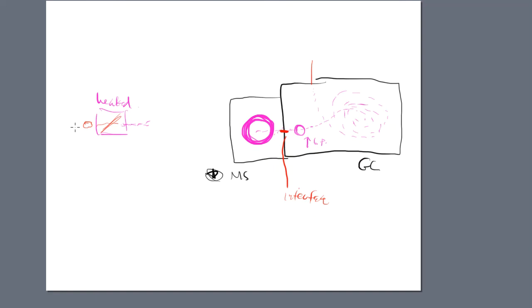All right. The other thing was the M to Z ratio, and the M to Z ratio was at the bottom of that computer screen. You saw that we set it at 35 and the maximum was like 200 and some. I'm just going to say 250. It might not have been 250. I can't remember, even though I played it just a minute or two ago. But 35 and the maximum, why do we choose these? They just seem like random numbers. And what does that actually mean?